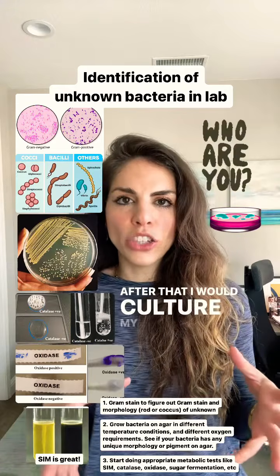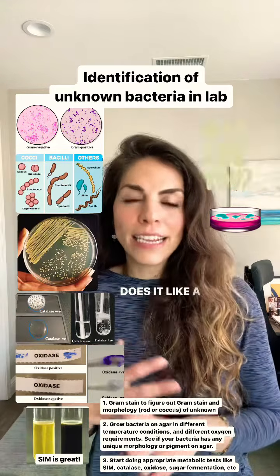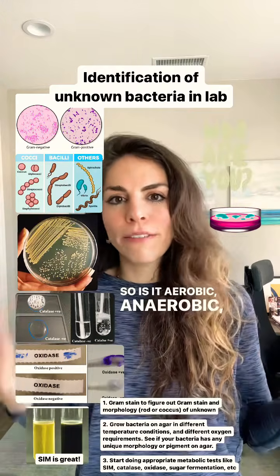After that, I would culture my bacteria, meaning grow it on agar. I would look to see if my bacteria produces a certain pigment. Does it like a certain temperature? I would grow it at different temperatures. I would also look for different oxygen requirements. So is it aerobic, anaerobic, facultative?